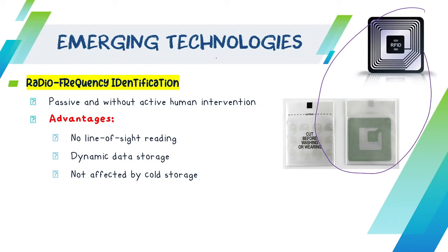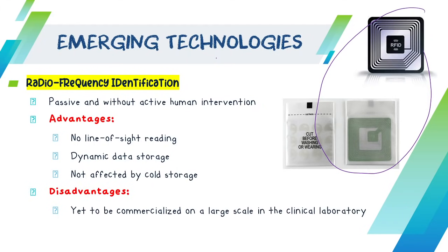So kana lang pud ang nakanindot sa iyaha na even if napa na siya sa sulod sa box or what, kay ma-scan gihapon siya. The disadvantage here is that it is yet to be commercialized on a large scale in the clinical laboratory, and syempre, as always, mao gyud ni ang common na disadvantage, greater gyud ang cost. Mahal daw ning mga RFIDs.